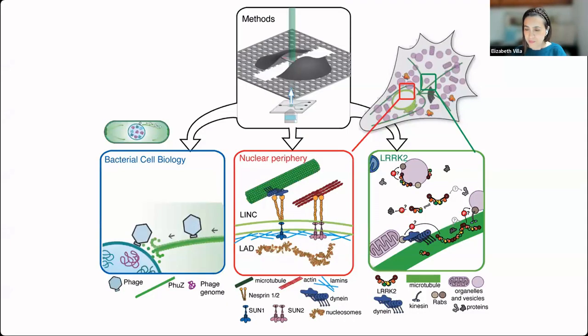And my lab, I like to say that I'm from Mexico City, and my lab has grown in similar directions as Mexico City grew, so pretty random. But today I want to talk to you about this part of the lab, which is bacterial cell biology, which we found very satisfyingly that cryo-electron microscopy is a useful tool to discover new biology.